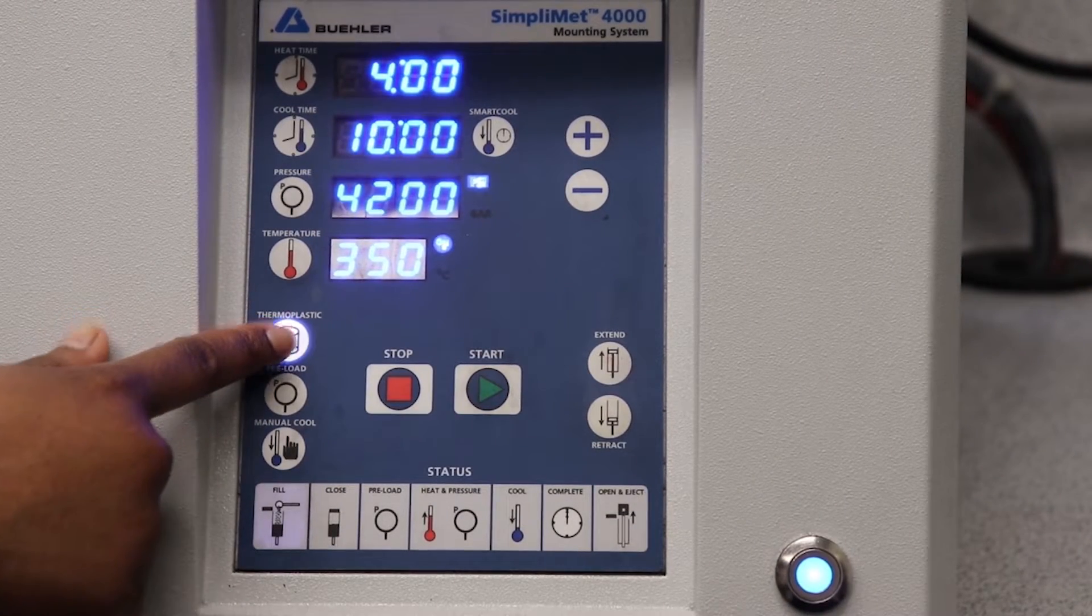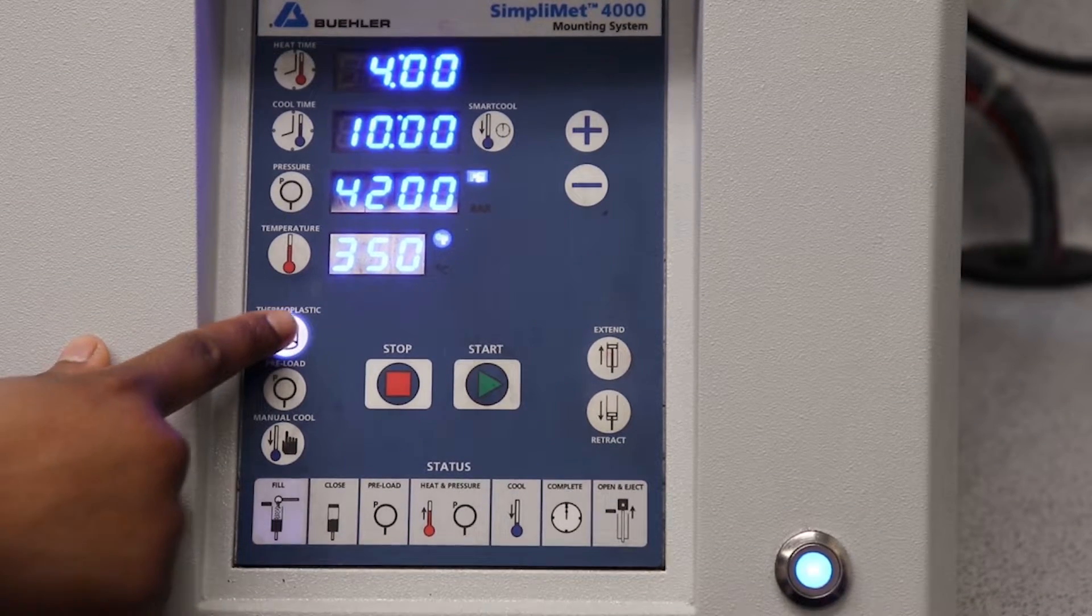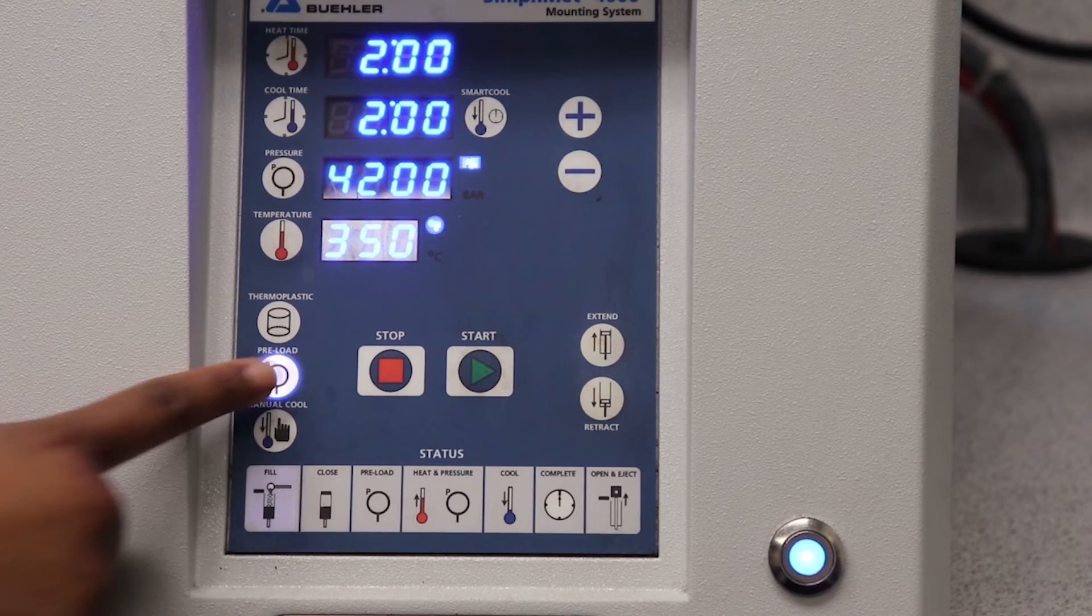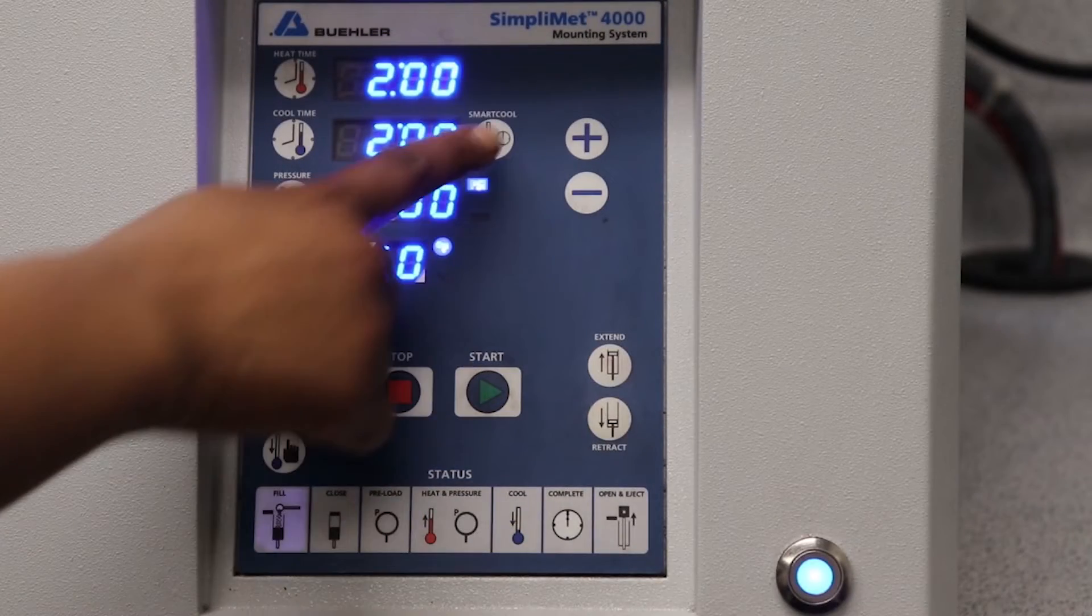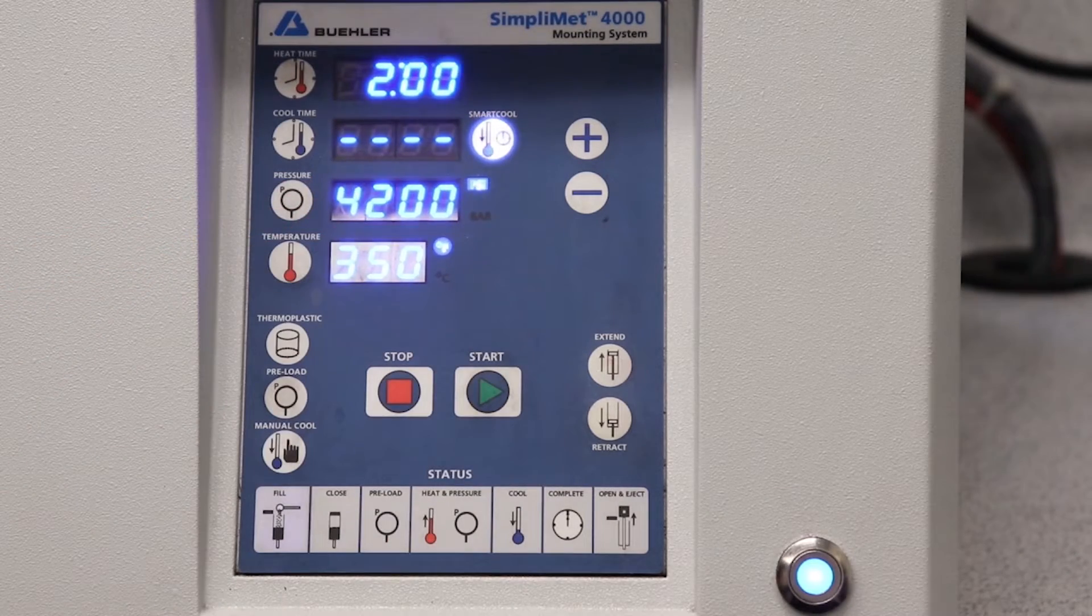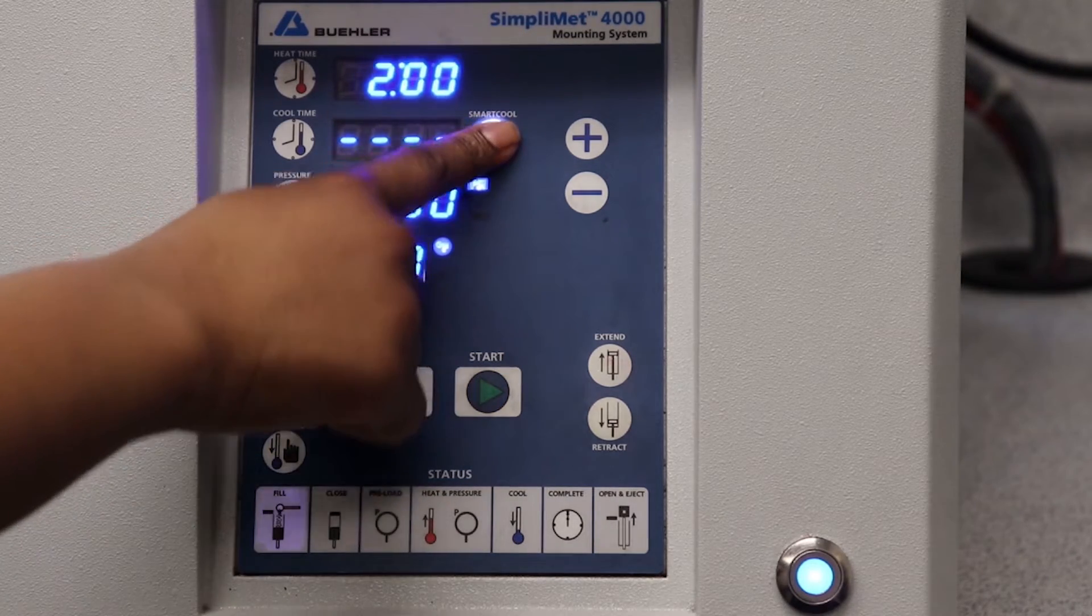The thermoplastic button is a button that retains variables for thermoplastics and inhibits the use of smart cool. The preload button applies a smaller pressure prior to applying the entire load. And the smart cool button is a function used to cool samples to a temperature where samples can be handled by hand.